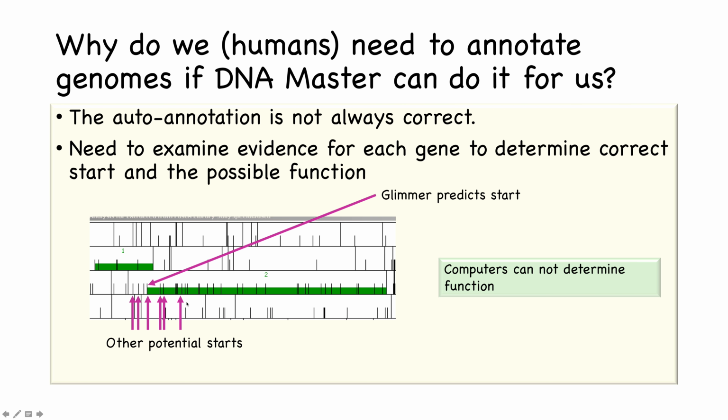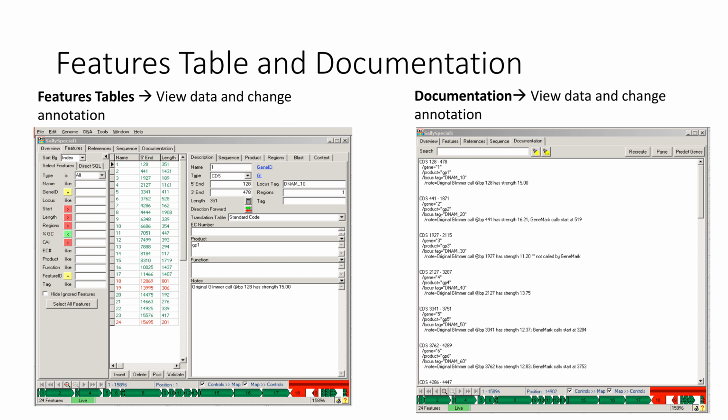And again, like I said before, the computers can also not determine the function. So we have a lot of work to do, but these programs give us a big head start in terms of shaping the genome annotation.